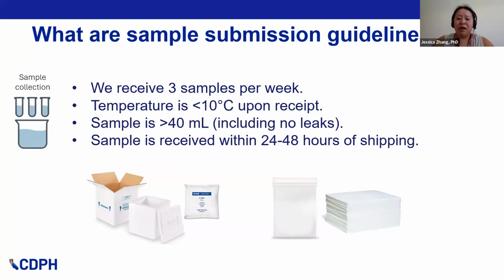And as mentioned before, ideally we receive the sample within 24 to 48 hours of the collection, and that we receive it within 24 to 48 hours upon shipping out to our lab.